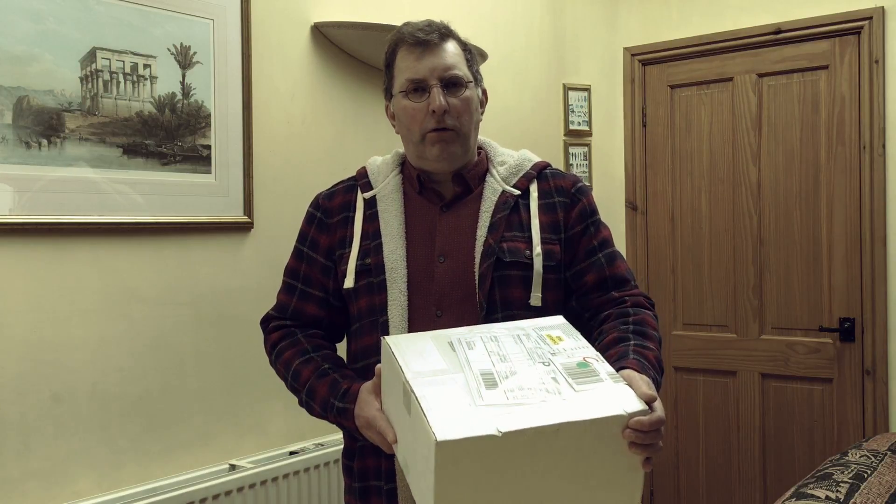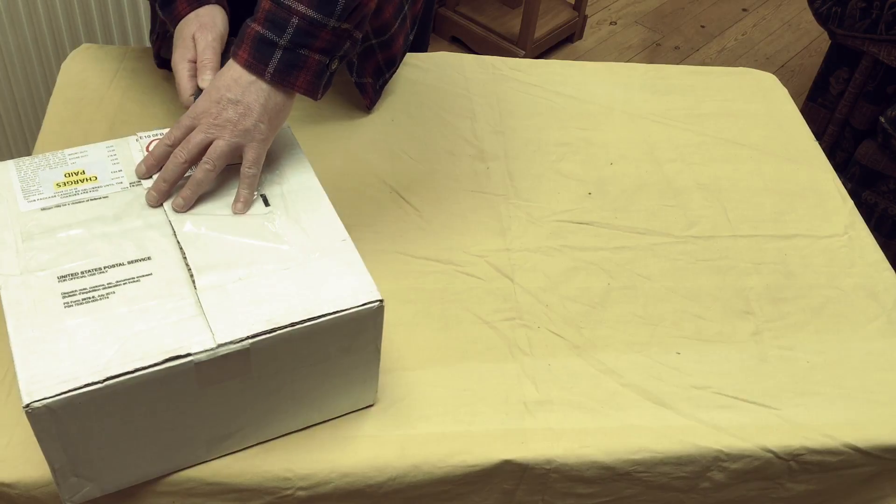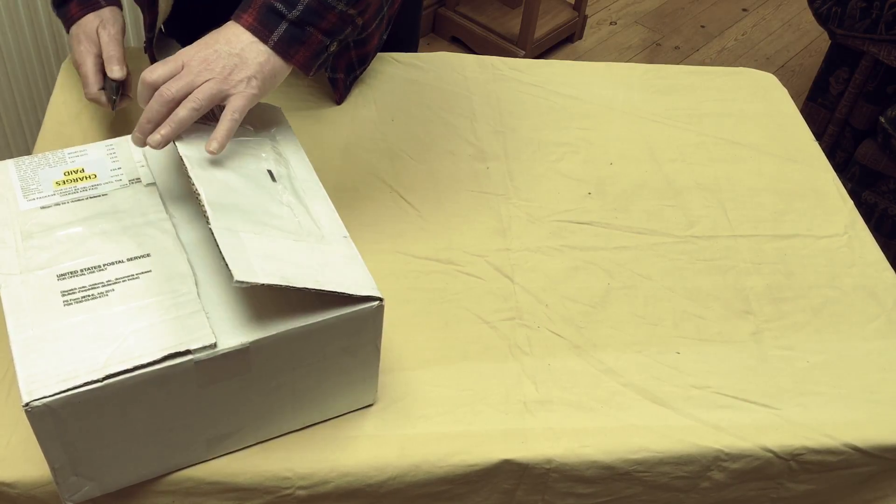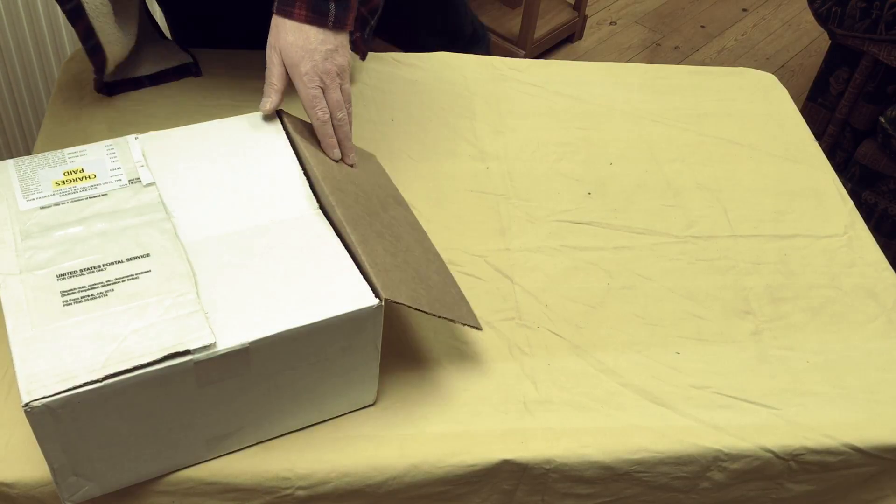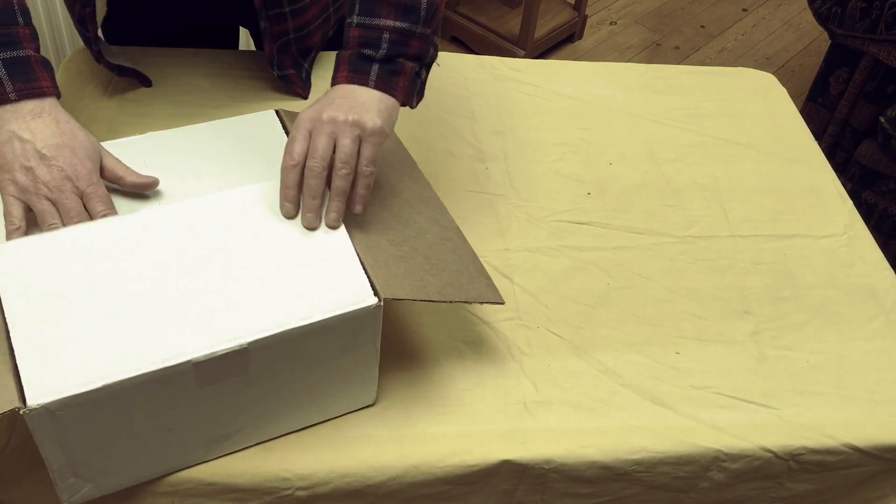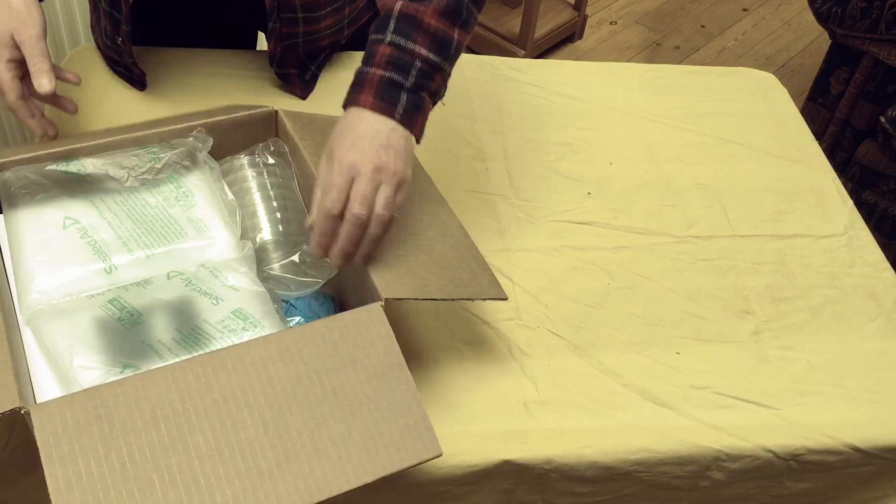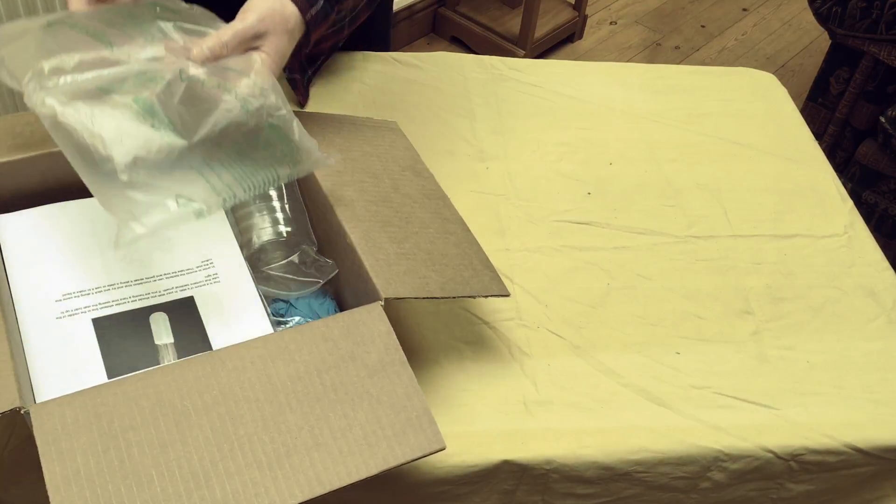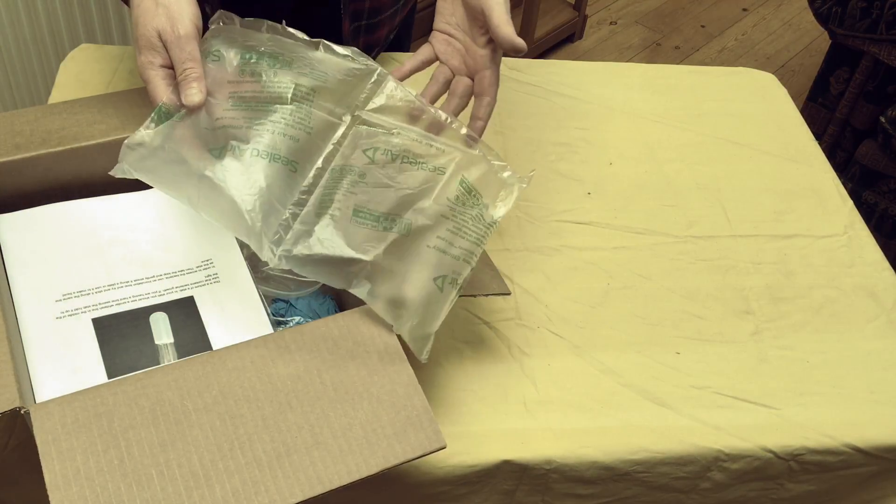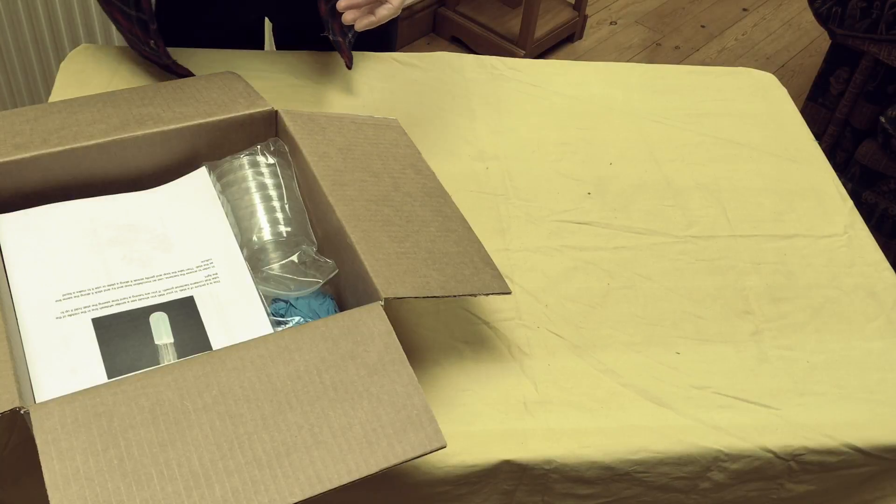But here it is, so let's open it up and see what's inside. Okay, so here's inside, some packaging, which we don't need.